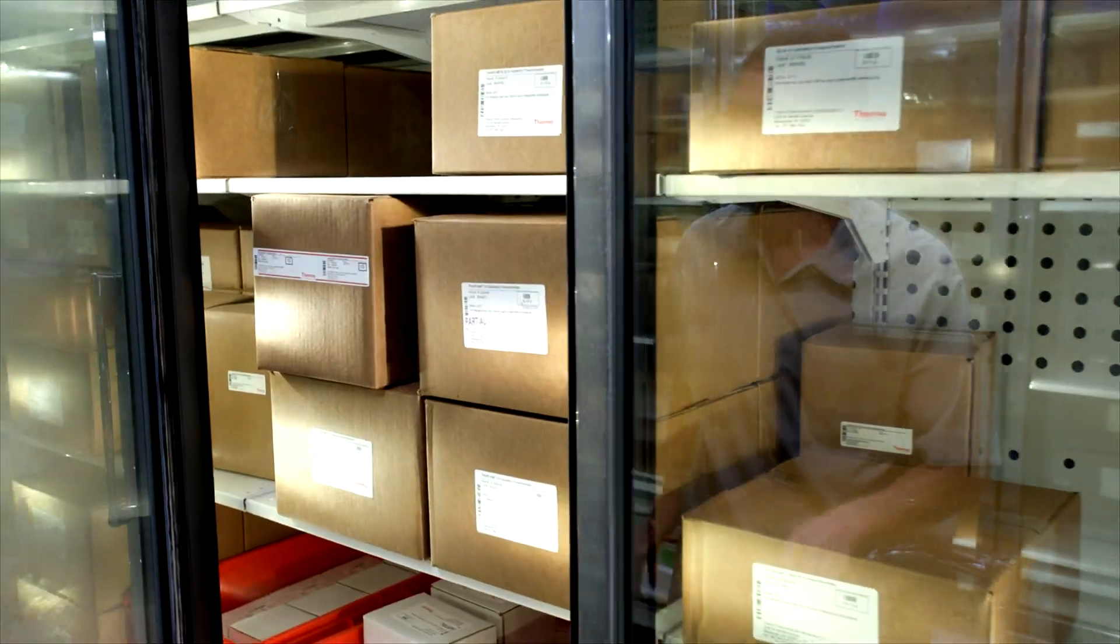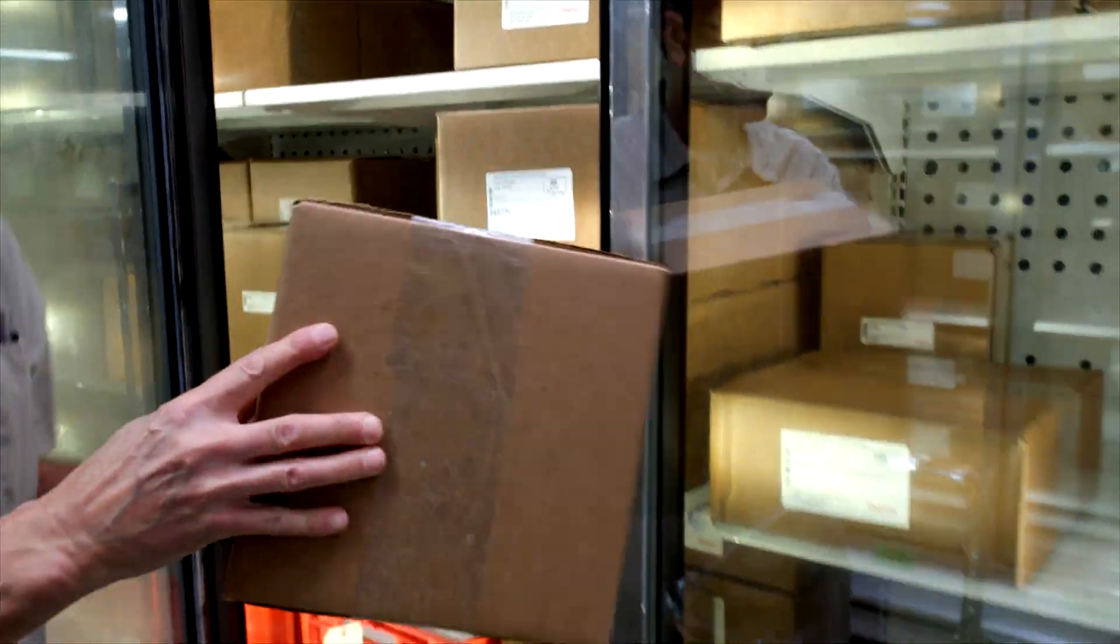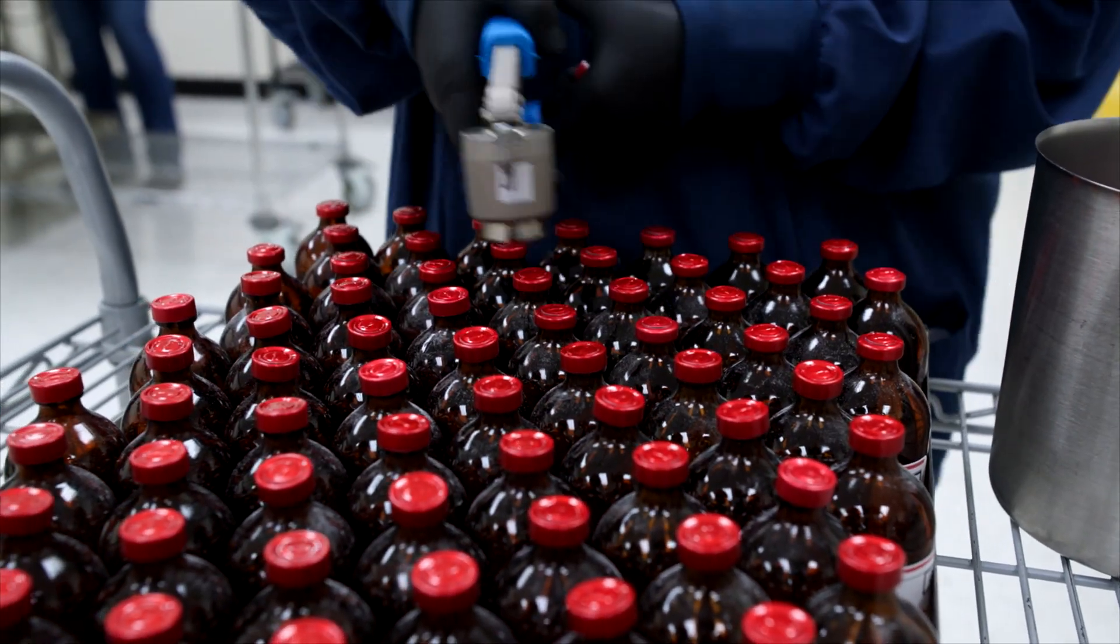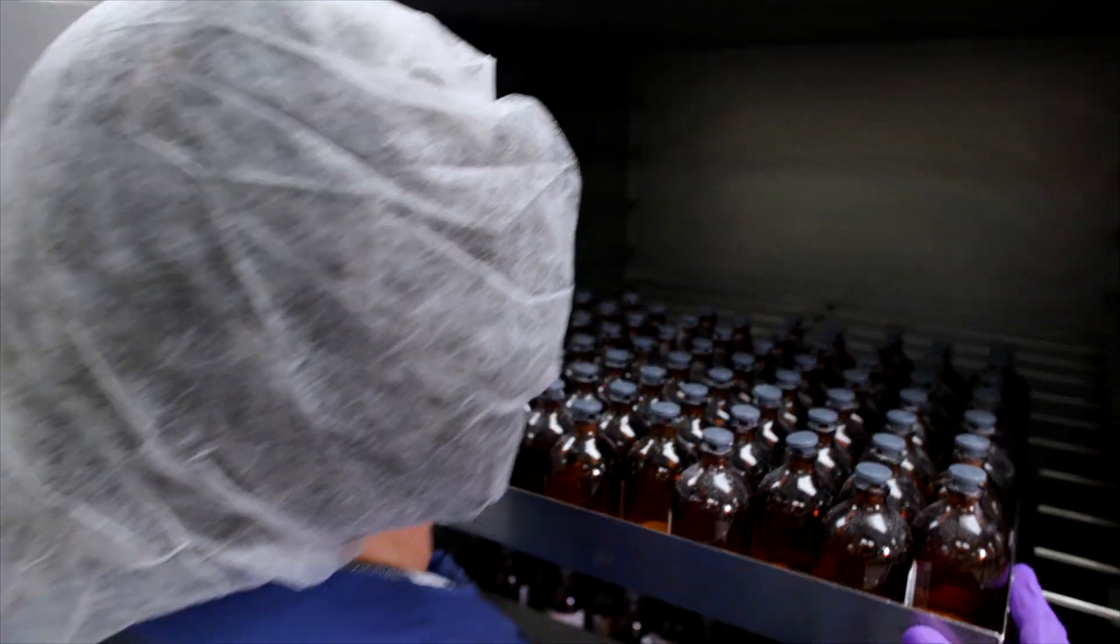We can also accommodate gram to kilogram quantities in many different packaging configurations based on your needs.